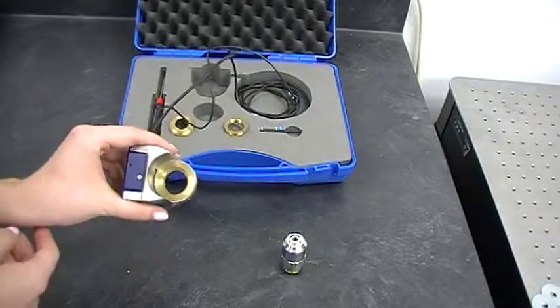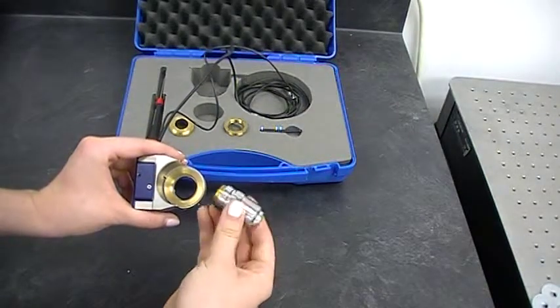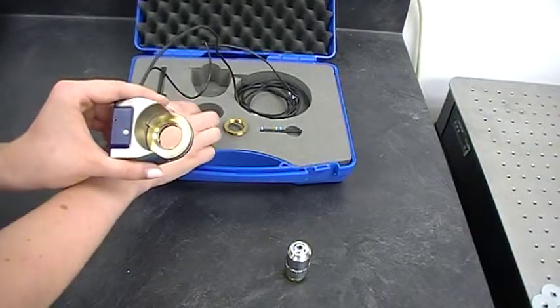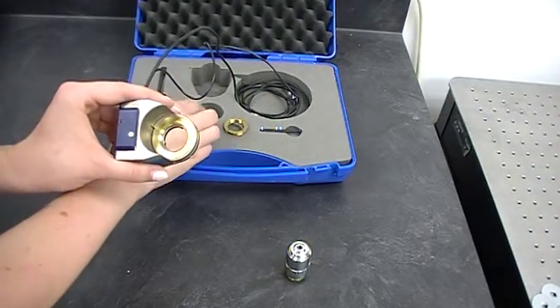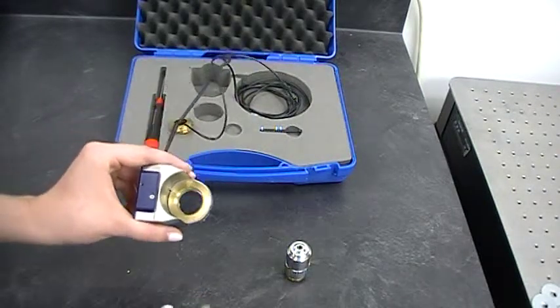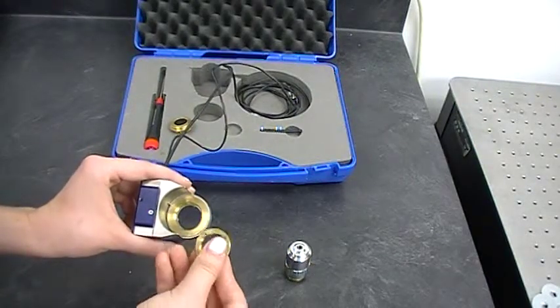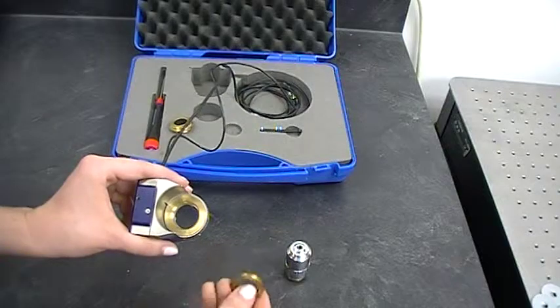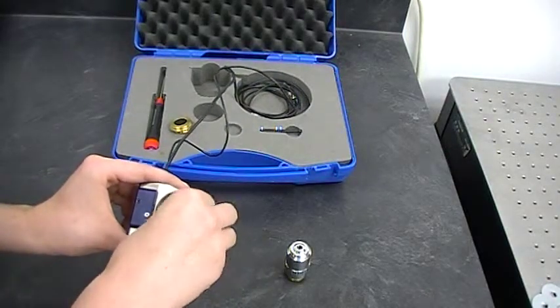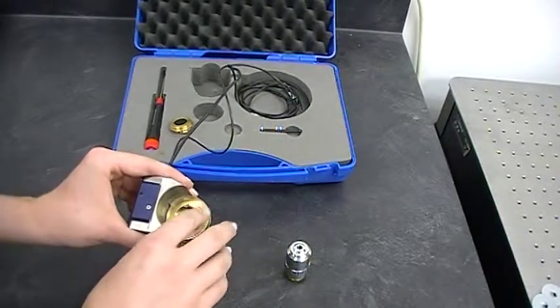As you can see, it has a rather large threading for our objective lens here, which we want to put in. Usually, if someone wants to use multiple objectives with different threading, they'll order something like this and then have adapters that come in a set with the system, like this one here. This adapter goes into the larger threading.